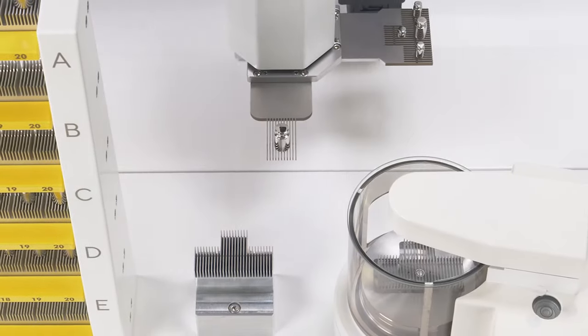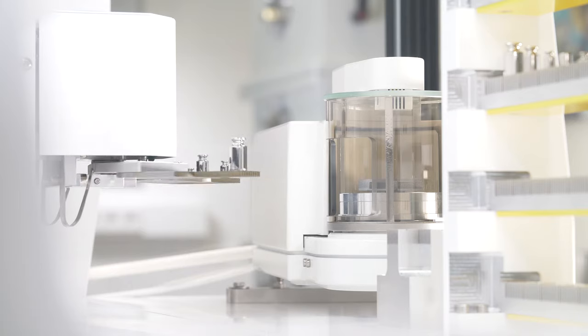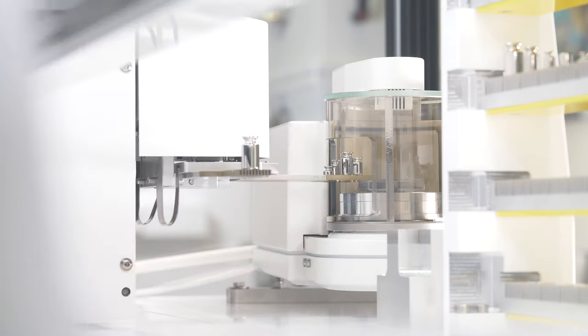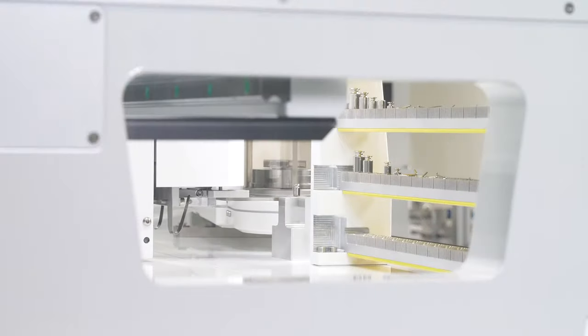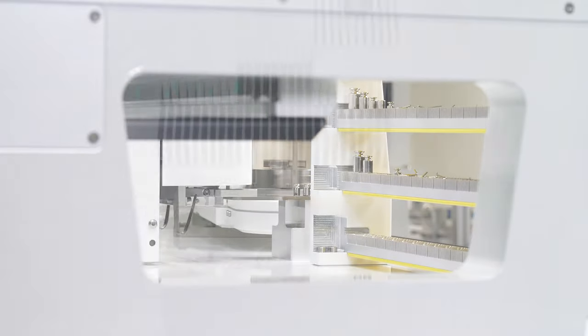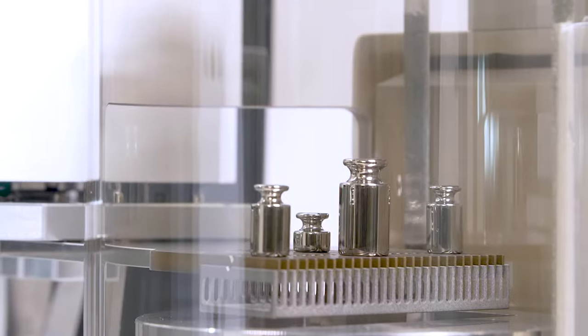Designed for simultaneous management of reference and test weights, the Sartorius dual robotic arm system with the patented multi and single weight handlers speeds up the processes with its most efficient motion sequences and handles the weights with the highest precision and consistency.